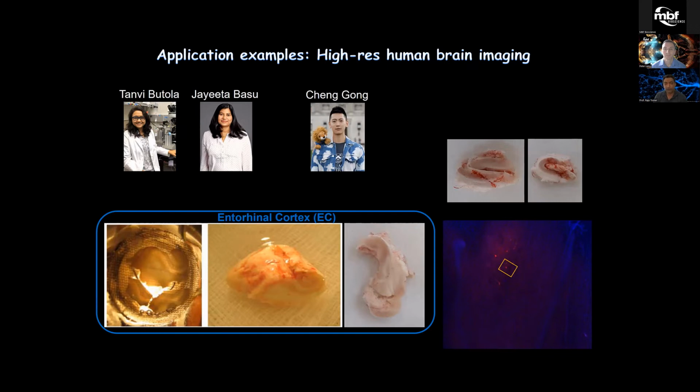So you end up with these large chunks of tissue, which are still large, and which have a few of these neurons labeled. The next goal is to be able to image them at a very high level of detail so that we can reconstruct the morphology, reconcile the electrophysiological recording with physical models of these neurons, and try to learn what's going wrong in various diseases.